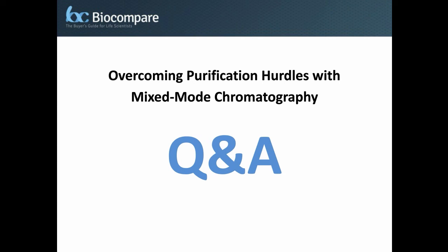Second advantage that mixed mode has over some other resins is that you can bind in fairly high salt. So if you're looking to load a fermentation harvest directly onto a resin without having to do any dilution, you might look at mixed mode.